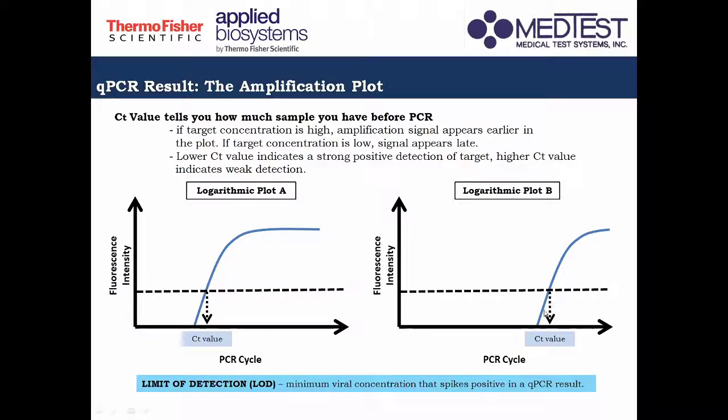So, paano mo siya malalaman, this is because of your CT values. So if you have a lower CT value, then that would indicate a strong positive detection of your target. So inverse yung relationship niya. Pag mababa yung CT value, ibig sabihin mas maaga yung fluorescence na nade-detect ng instrument, which means mas madami yung DNA na nandun sa sample niya. No?